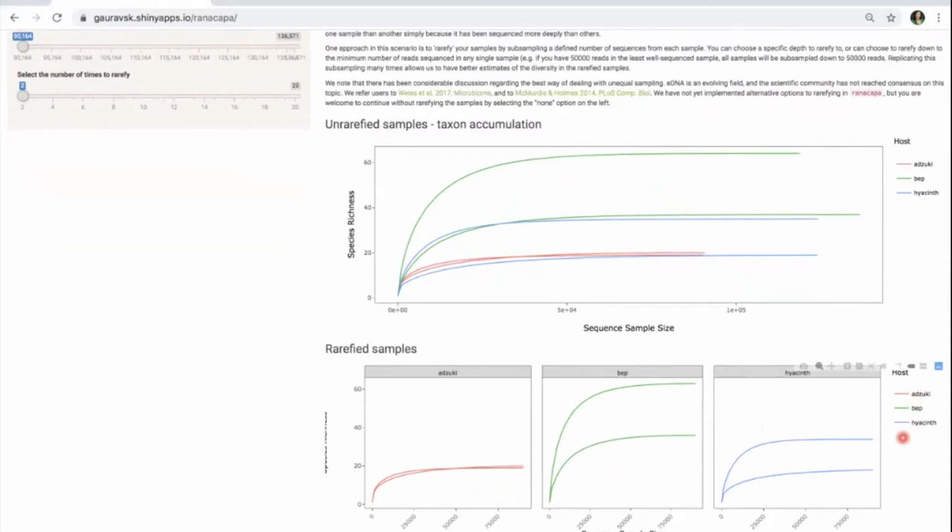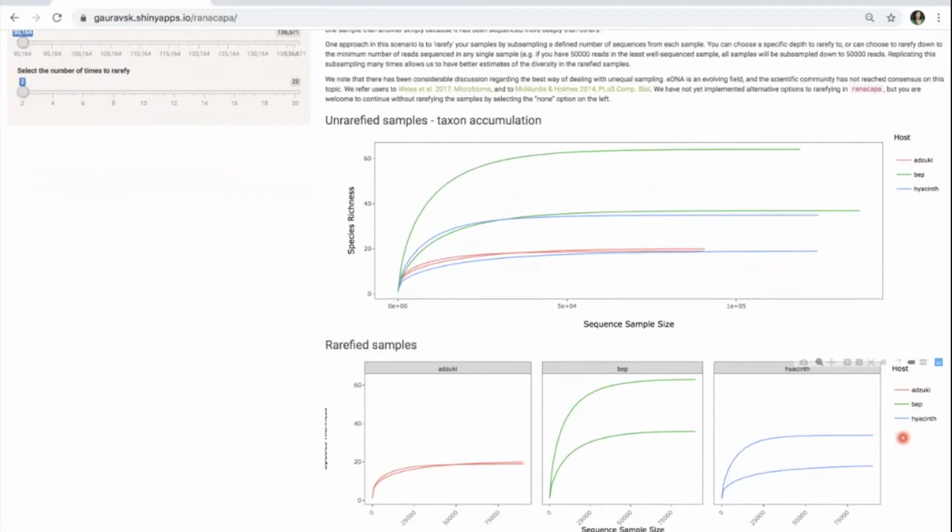It reduces the number of graphs, and it just helps everything be more succinct. It also gives you some good information about the reproducibility of your replicates. So in this particular experiment, we had 2 replicates of each bean type. We had 2 Adzukis, 2 black-eyed peas, and 2 hyacinth bean samples that we sequenced.